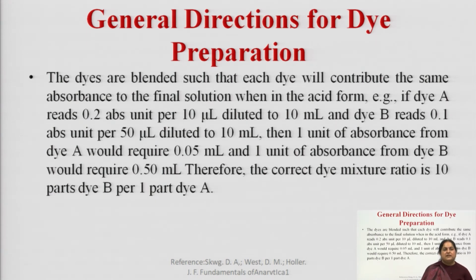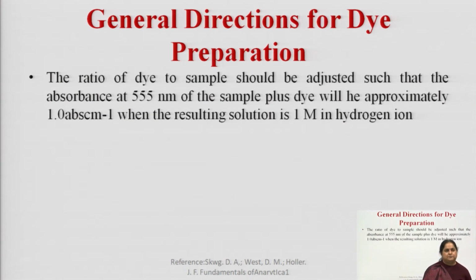So, we will select the concentration of the dyes in such a manner so that they will contribute to the same absorbance together.